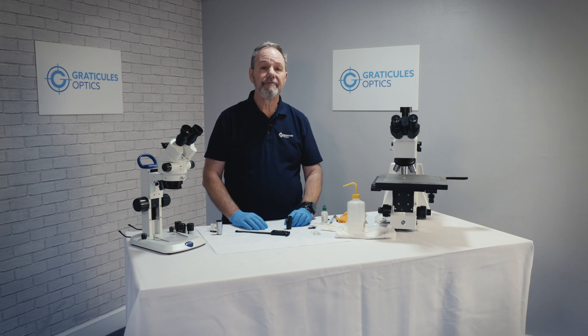I'm going to show you how to size and fit an eyepiece reticule. A reticule equips the microscope with a measurement pattern which can be used for a range of purposes.